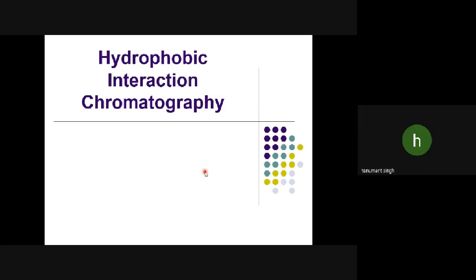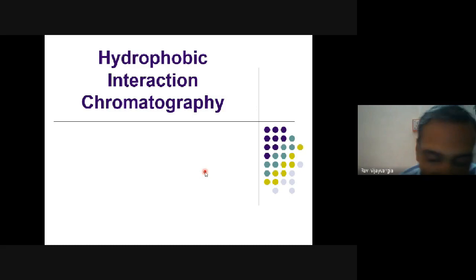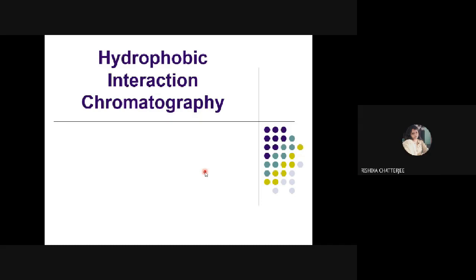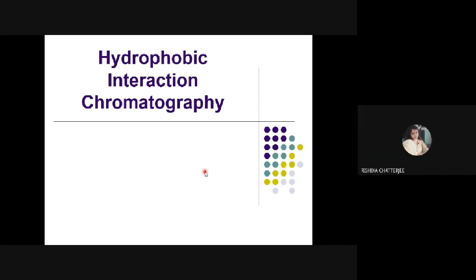Thank you very much. So hydrophobic interaction chromatography is basically mostly used in HPLC only, as we will see now. Okay. So I was asking, can you name some hydrophobic amino acids? Anybody? Sir, mainly glycine, aromatic amino acids. Aromatic ones are hydrophobic, not all, but tryptophan, tyrosine. Glycine.